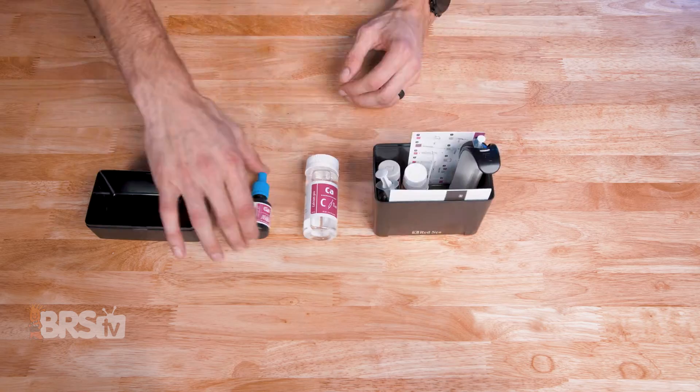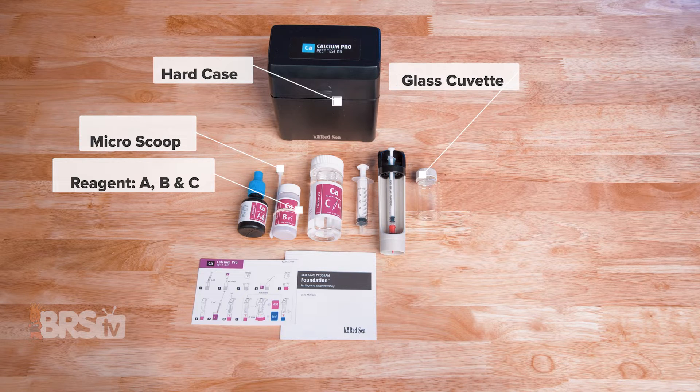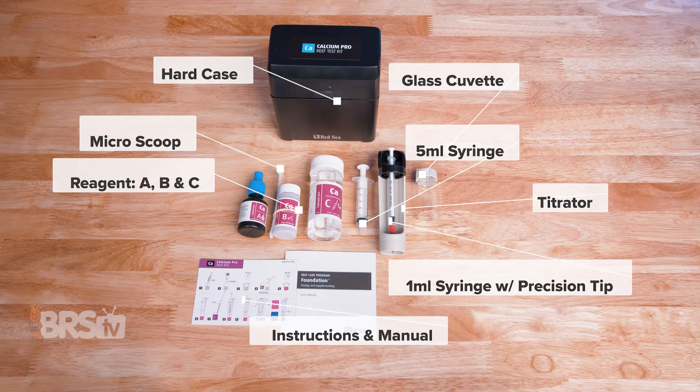In the box, you'll find the hard case containing reagents A, B, and C, a micro scoop, a glass cuvette, a five milliliter syringe, a one milliliter syringe with a precision tip, the titrator, and the instruction card and manual.